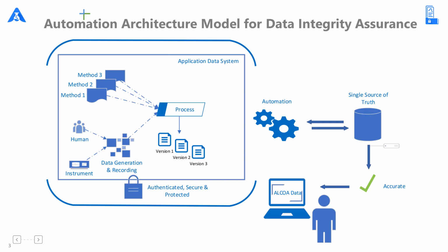There are several applications which generate data. Data is generated based on certain metadata. Let us assume method 1, method 2, method 3 are the different methods of processing data. Each method can create different versions of data. The analogy of this presentation can be imagined along with a chromatographic data system.